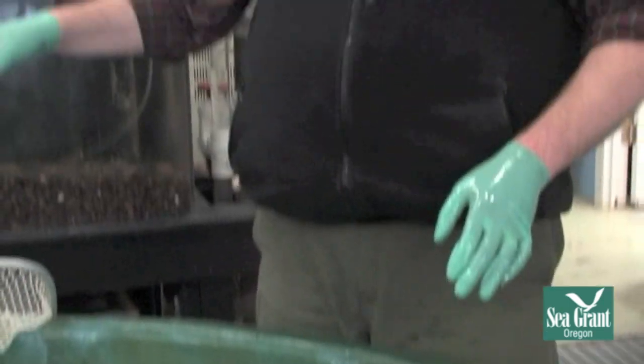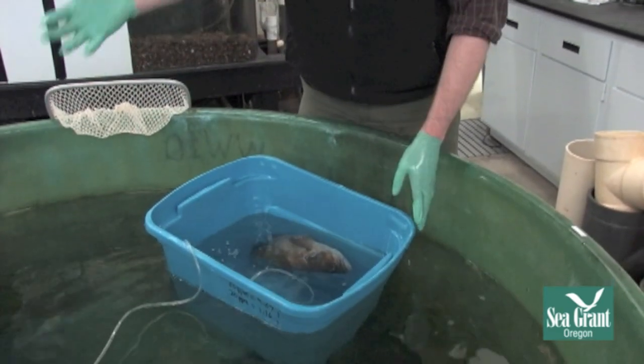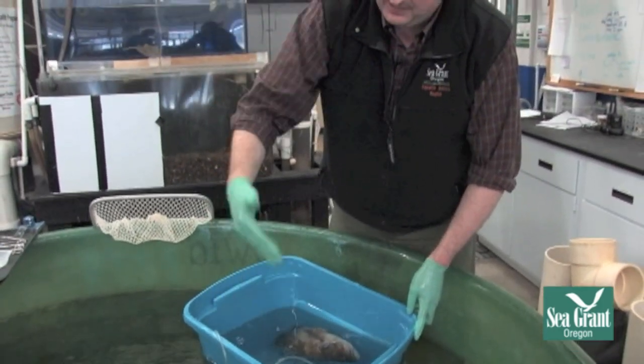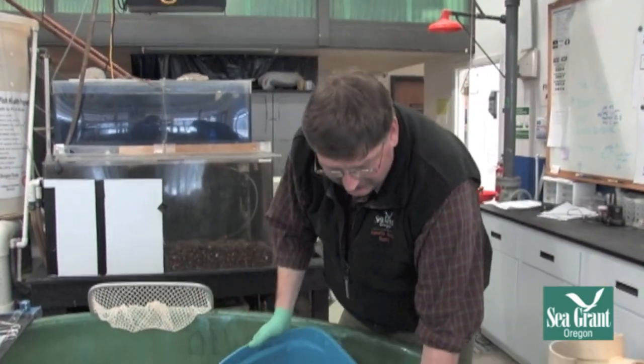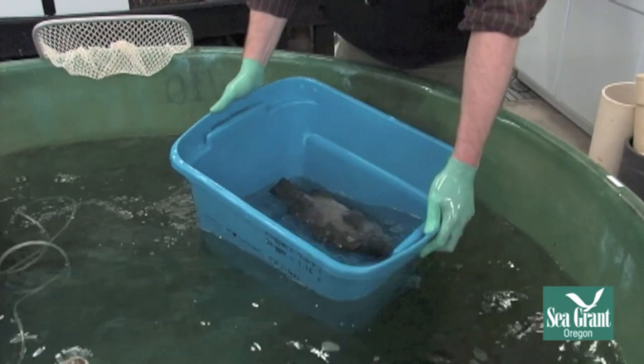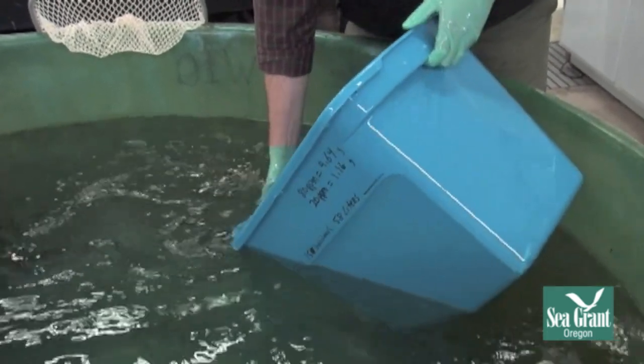Now we have our sample and we would go look at it under the scope. But you never want to leave a sedated fish by itself, so I'm going to show you how to recover the fish. In a tank like this, I can just do a quick water change — the water is coming in from the bay, being filtered, and going right out. If you didn't have that capability, you could have another tote set up with fresh water without drug in it and an air stone, and just move the fish in there.